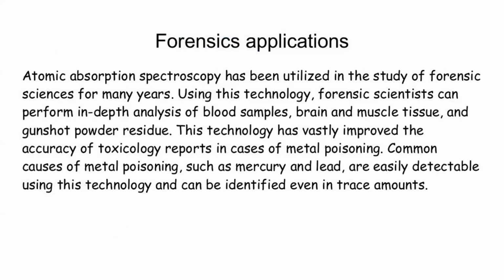In forensic labs also atomic absorption spectroscopy is used. Here the forensic scientist can perform in-depth analysis of blood samples, brain, and muscle tissue, and common causes of metal poisoning like mercury and lead poisoning are easily detectable by using this technology.